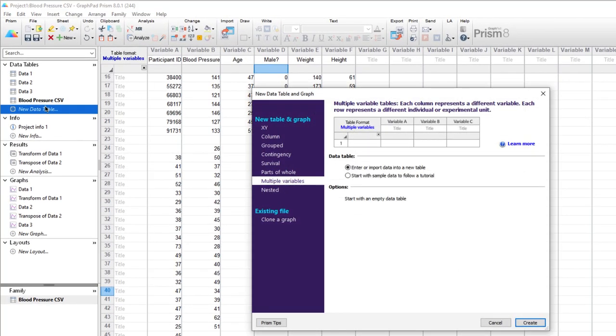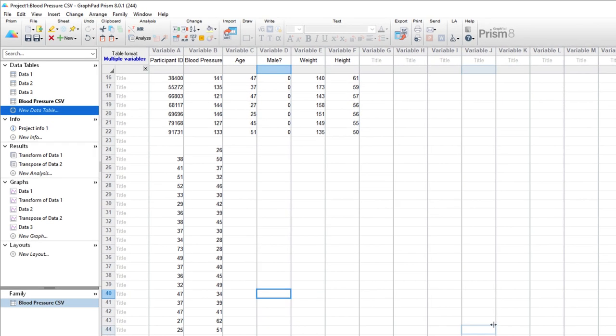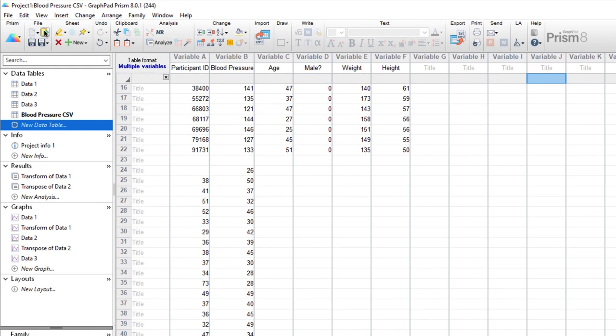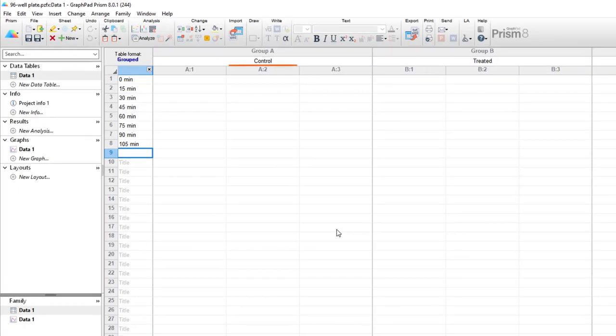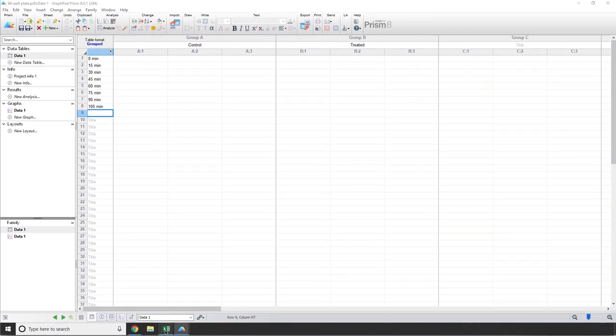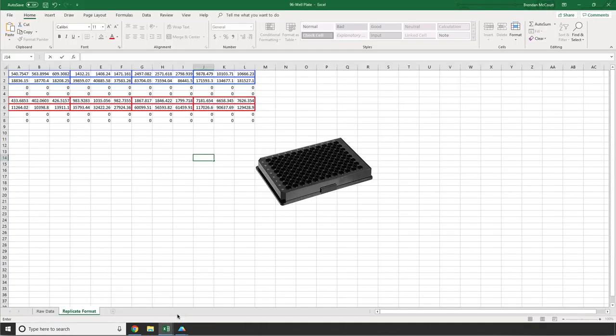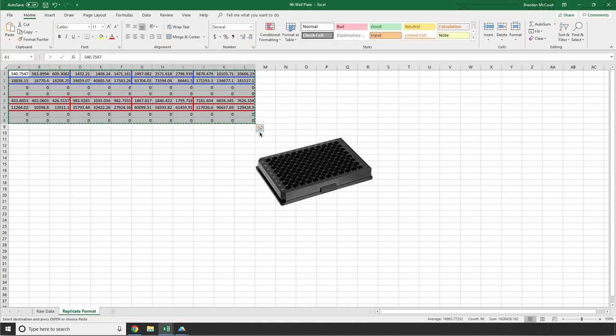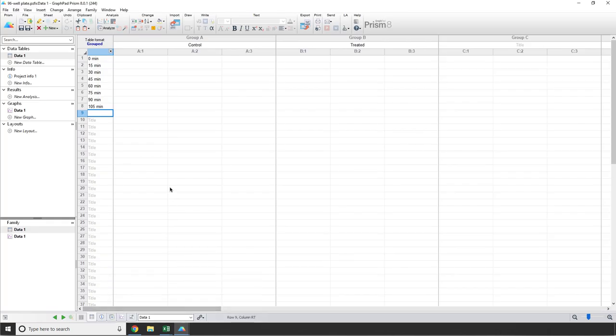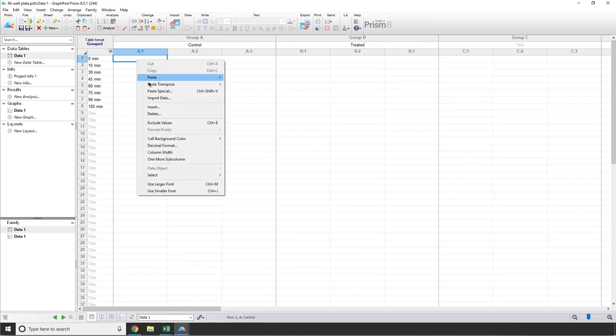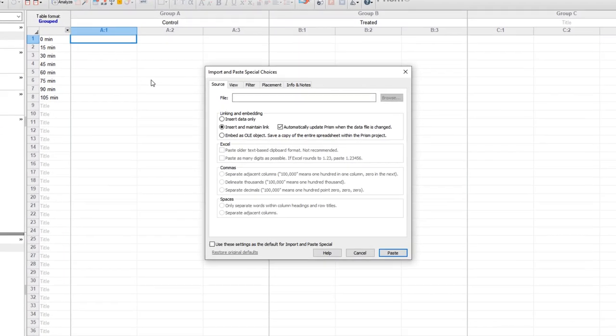In Prism, we would use a grouped data table to represent such a structure. I've got a Prism file set up with the structure that I described, a control group and a treatment group in columns, and the eight time points in rows with three replicate measurements at each time point. Now, I could manually enter the data or copy and paste values in three at a time, but instead, what I'm going to do is copy the entire set of data, and in Prism, I'll paste special. As before, I can just paste the data, link it, or embed the entire workbook. Let's link it.